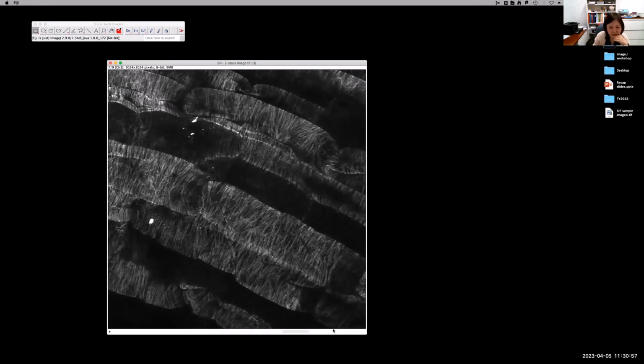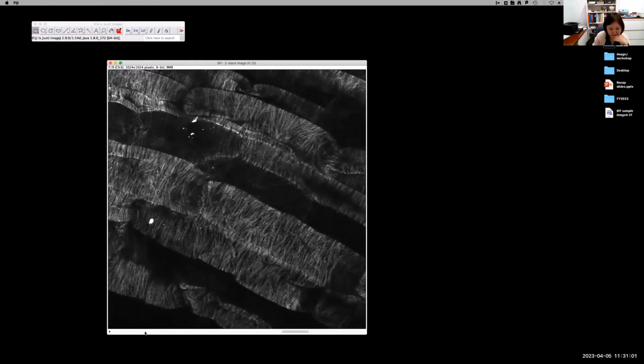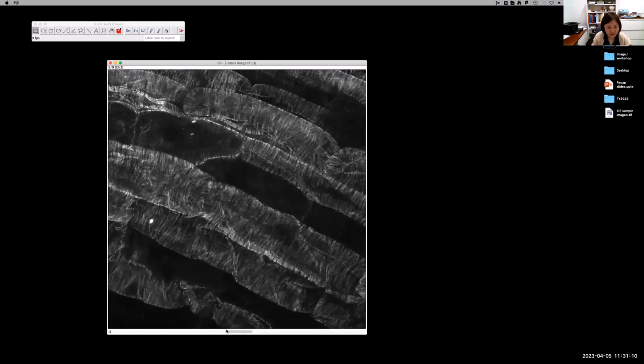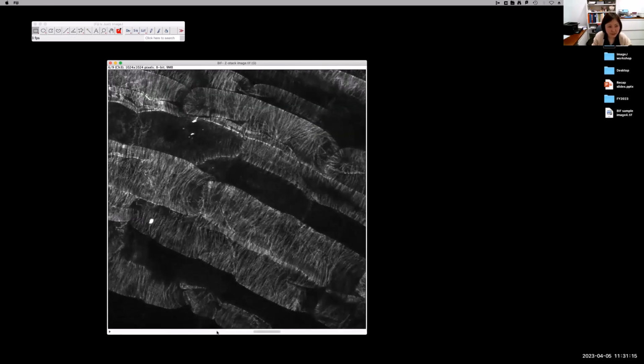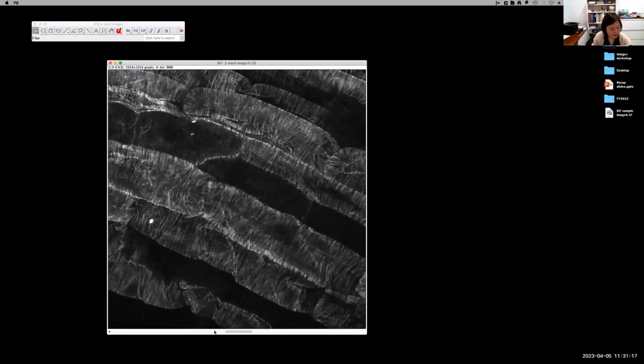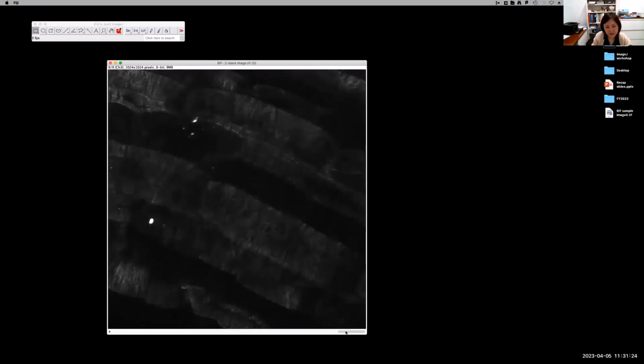Okay, let's say I want to eliminate slices 1 to 4. I want to keep slices 5, 6, 7, 8. Okay, I want to keep slices 5 to 8.